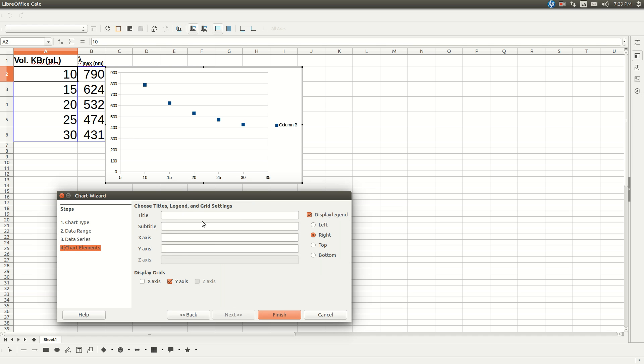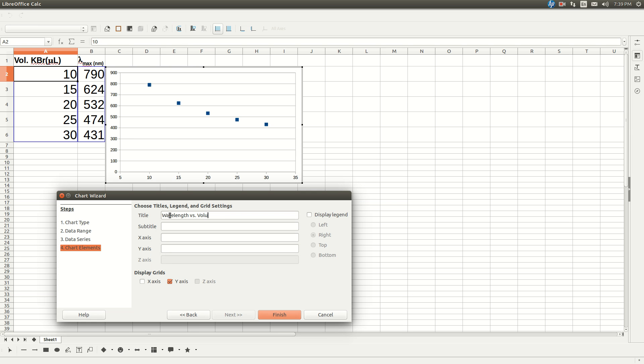Input your title. Un-click display legend. And for your title, it will be wavelength versus volume of KBR. Subtitle will be your name.